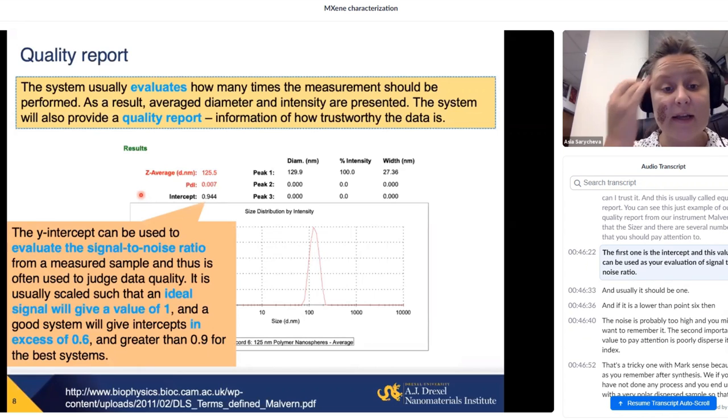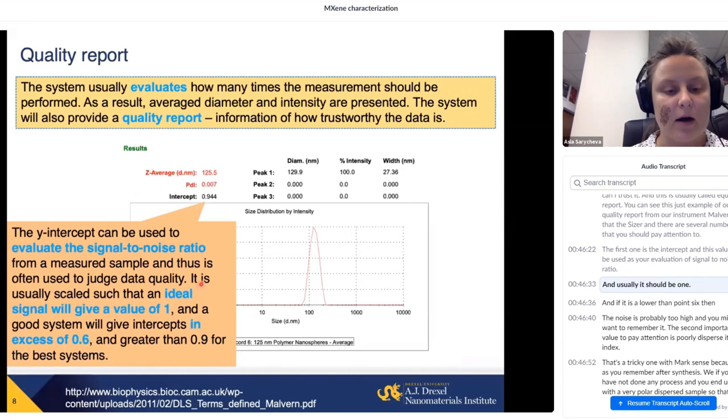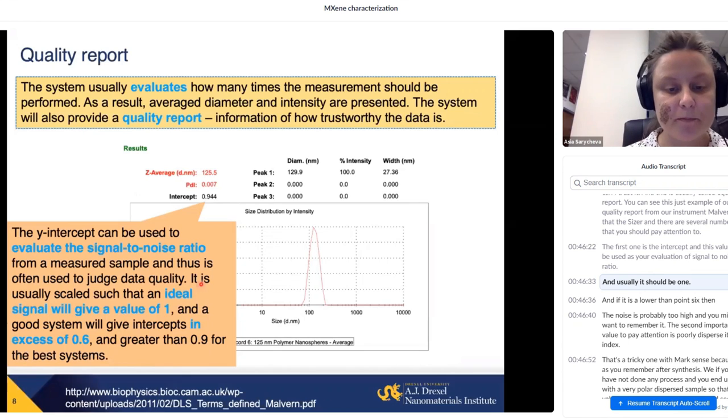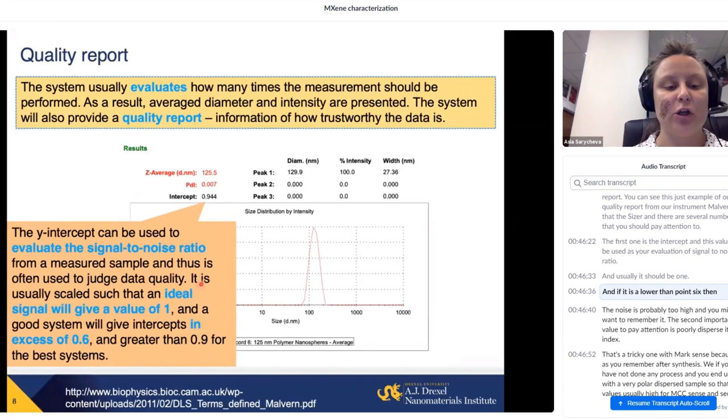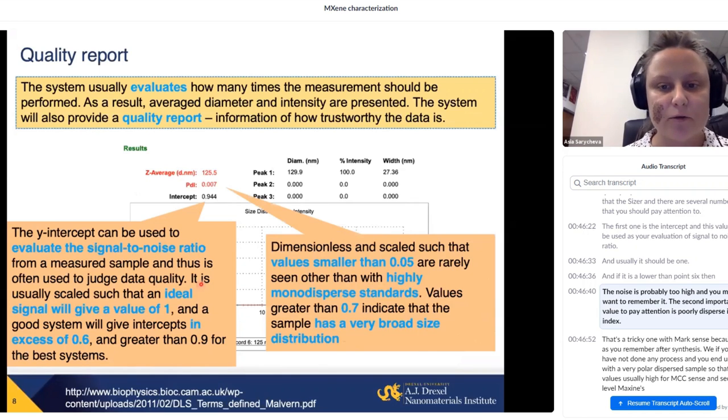The first one is the intercept. And this value can be used as your evaluation of signal-to-noise ratio. Usually it should be one, and if it is lower than 0.6, then the noise is probably too high and you might want to remeasure it. The second important value to pay attention to is polydispersity index.